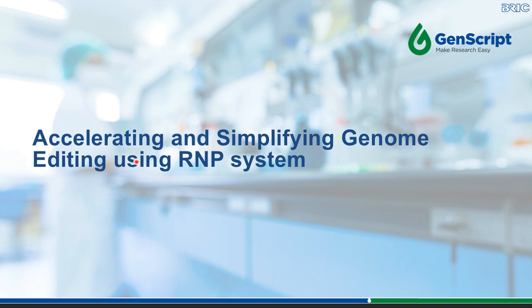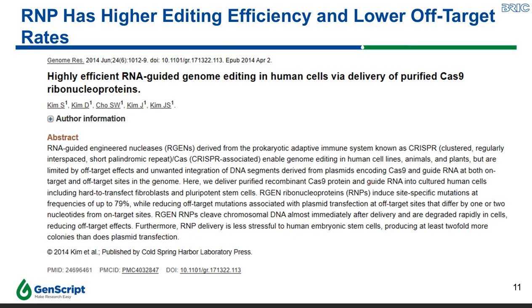So now I would like to switch gears a little bit to talk about how the RNP system could help to accelerate and simplify the entire genome editing workflow. Here I show you an article published by Kim et al. from Seoul University in 2014, in which the authors studied the RNP system to improve the genome editing efficiency and efficacy.